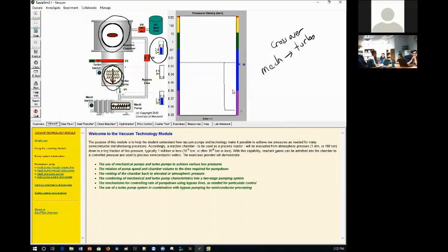Once I do that, look at the pressure change. The pressure goes down to 4.4 × 10^-9. That's like another ridiculous number. In this ideal world, everything can happen nicely. Now, this line here is still millitorr, but this turbo pump started working, and it took it down to 4.4. Okay.